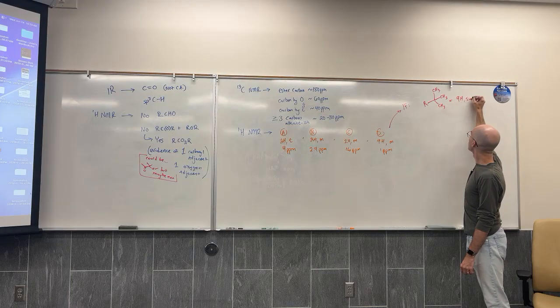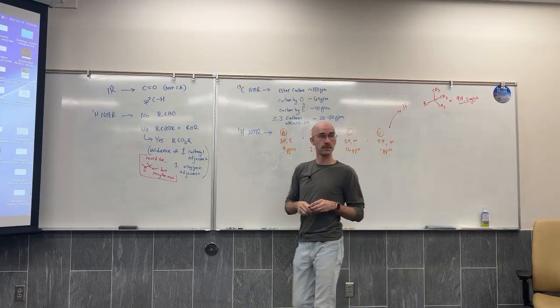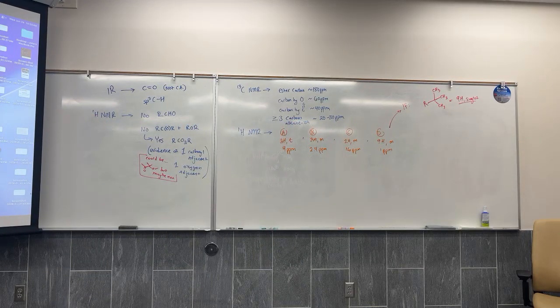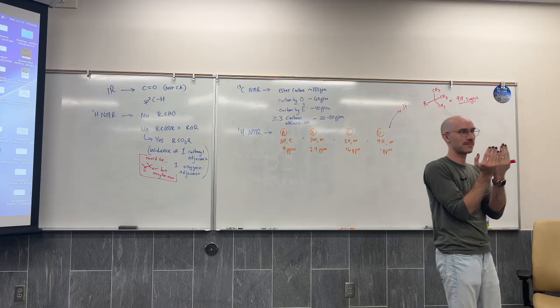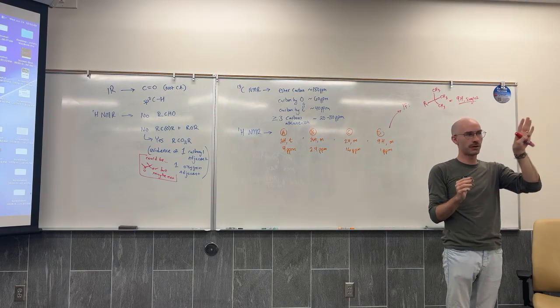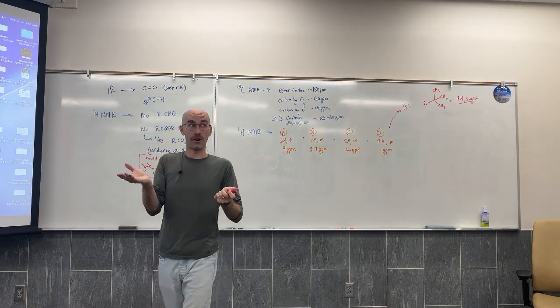Could it be 3 CH3s connected to 3 different carbons? It could be. If you look at the signals, the more I look at it, I feel like I'm looking at a doublet on the right and a triplet on the left that are just butted up against each other. So you're saying two CH3s to one carbon and one CH3 to a separate carbon? I think there's two identical CH3s and one separate CH3, but that's hard to know.